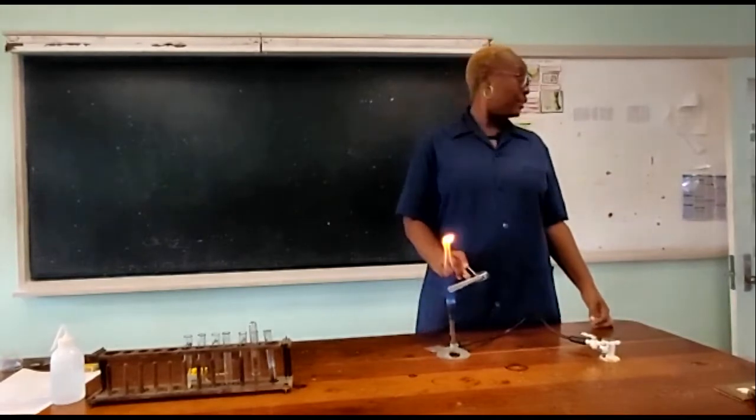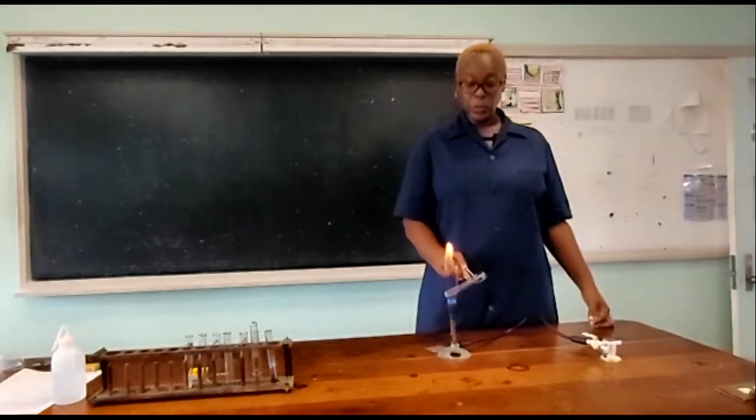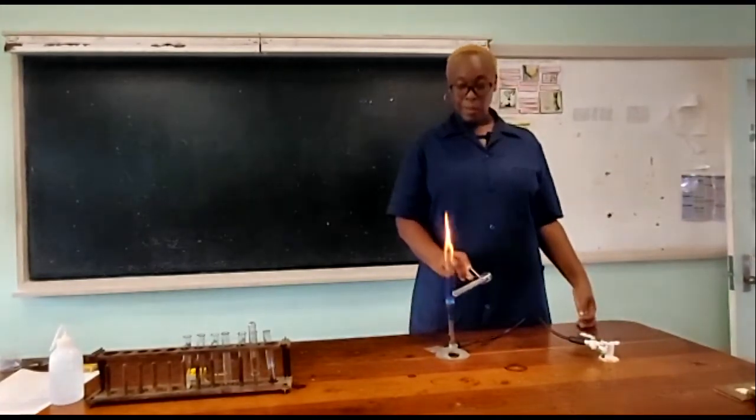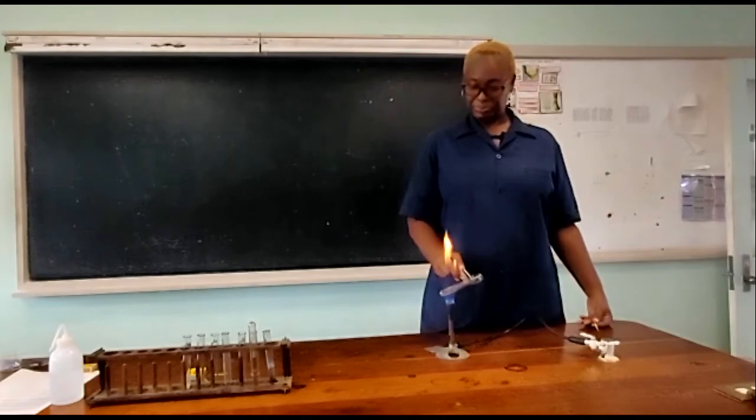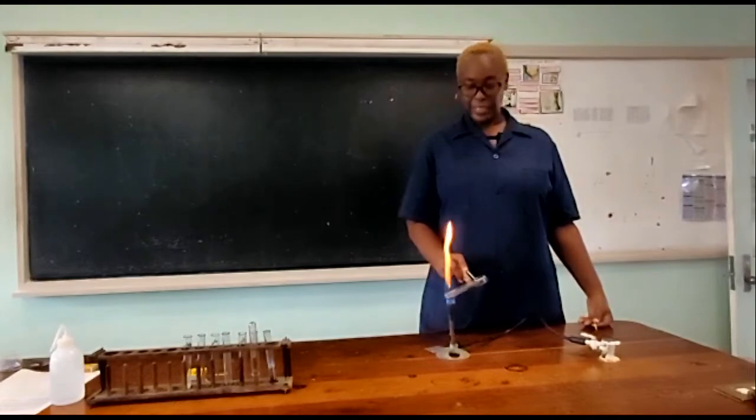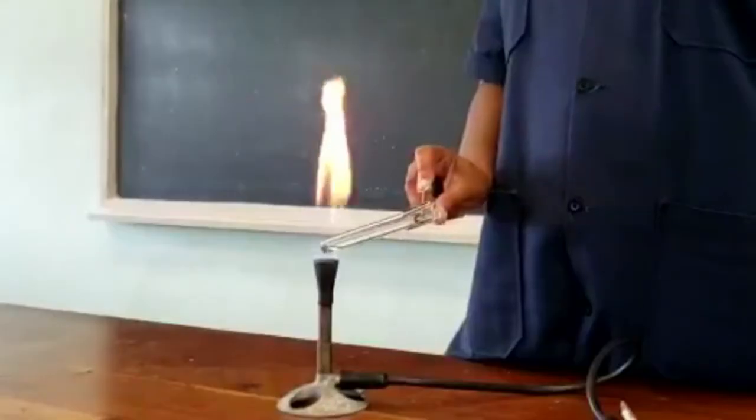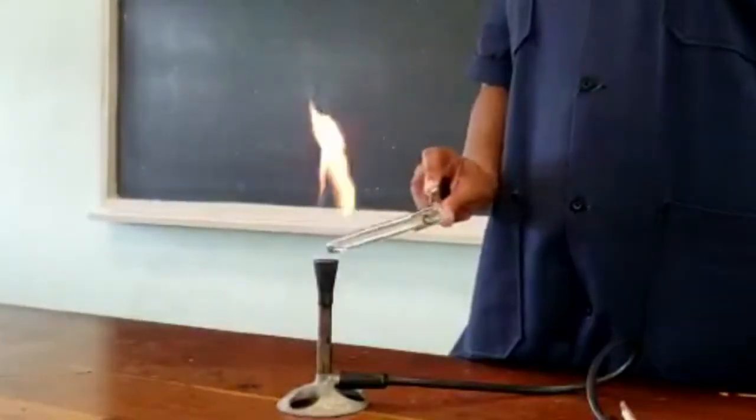Now the fact that we have to heat it so much, so long and so hard, what does that tell you about the stability of the sodium nitrate? Now we're just going to heat it for a little bit longer. Let's see if we get anything happening.